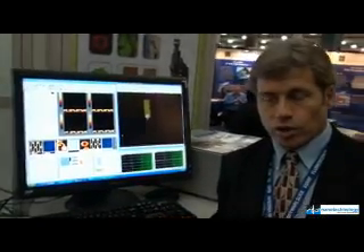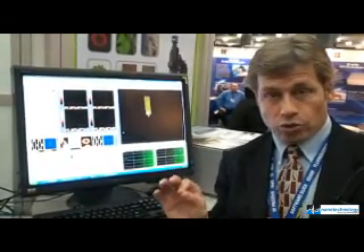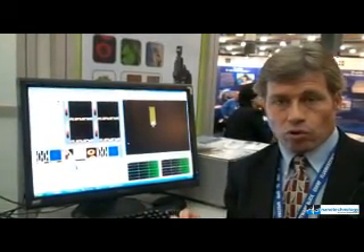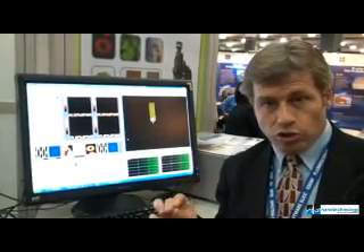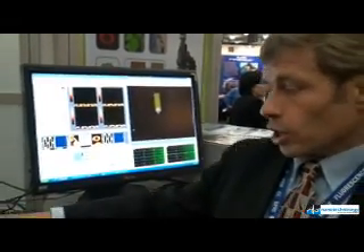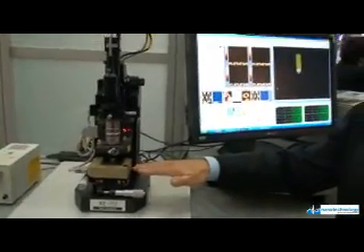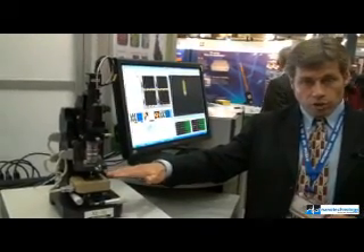What that allows us to do is get into features that are very small. On a semiconductor device, that could be a trench inside of a 22 nanometer node DRAM or SRAM device. It's important for the manufacturer to control at that finite scale — thousands of times smaller than the hair on your head — how those features are created. We take the specimen and locate it on an XE70 platform, something relatively small, say 2 by 2 inches in size, and we can image every aspect of what's on that sample.